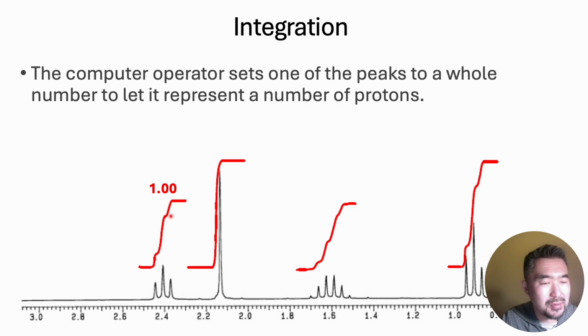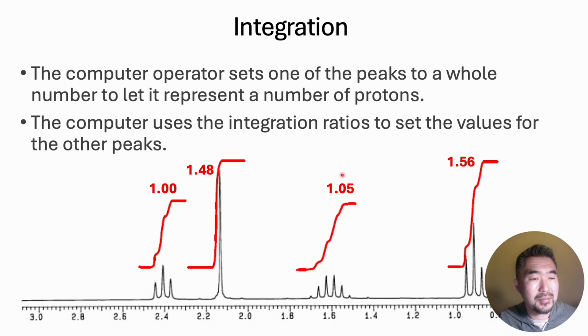So it's stepwise into 3. This is smooth because there's a singlet. This is stepwise into like 6 little peaklets. But this is what it would look like. Now, the software for the NMR doesn't know how many protons each peak has. That is up to you, the chemist, to interpret.